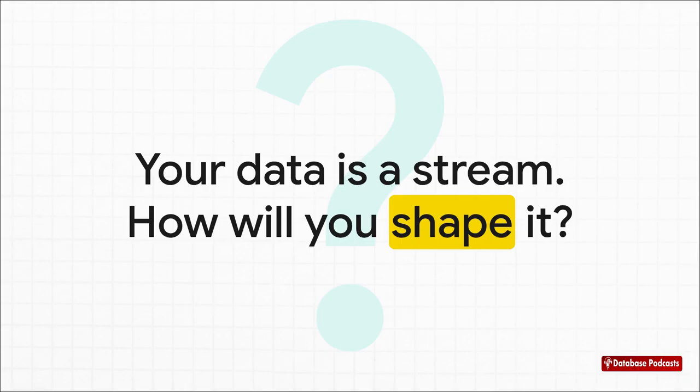You see, this whole approach is more than just learning a few commands. It's a fundamental shift in how you think about your data. You stop seeing it as a static file that you have to load, and you start seeing it as a dynamic stream that you can shape, filter, and transform as it flows. So the real question is, now that you have these tools, how will you shape your data?